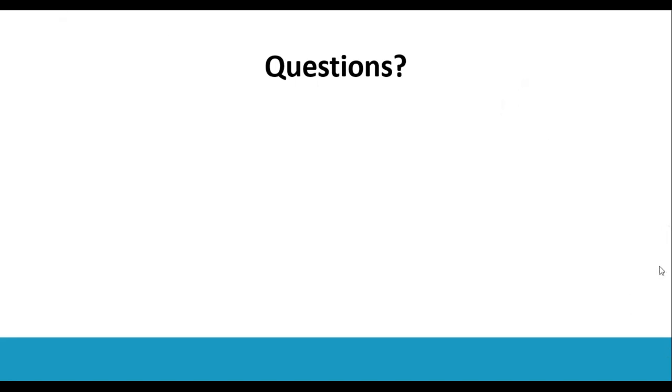Thank you. We have another question here from Majid Sartaj, and they say thank you for the presentation, and that while his background isn't in surface chemistry, he does use results of samples that he sends to labs. Lab results show two values, one based on BET and one based on Langmuir, which are different. How do I interpret these, and which ones do you use, and which ones should we use?